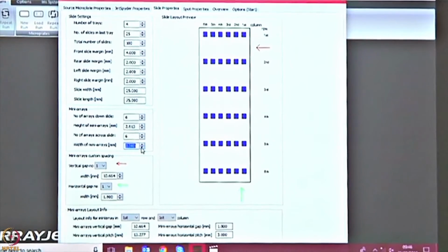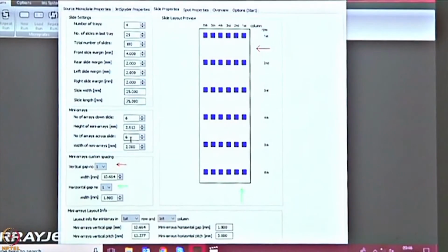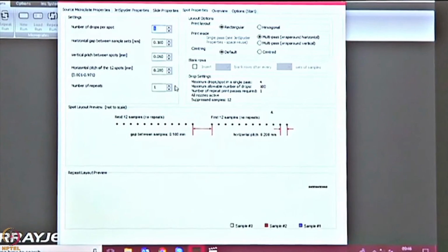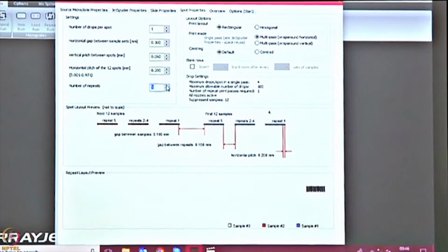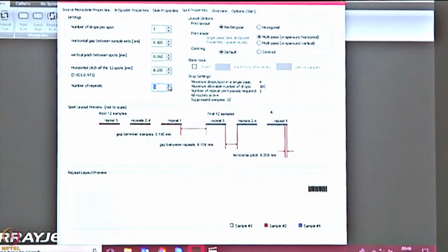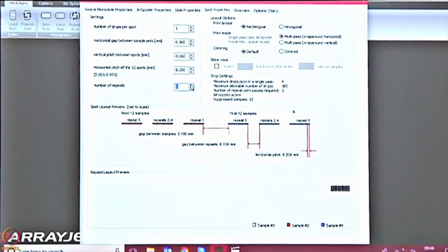So you can multiplex it. So right now I have given it several squares. And I can duplicate it. So most of the work in proteomics, obviously you want to get high reproducibility, so you duplicate, you triplicate it. So the HuPro is about duplication. So you've got 19,000 times 2 features. I can triplicate, so this is how it looks.